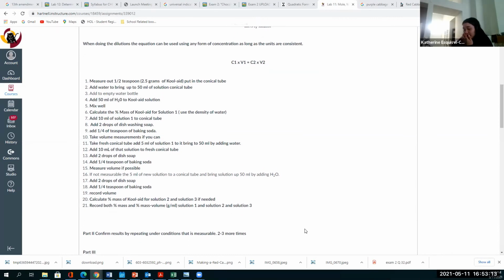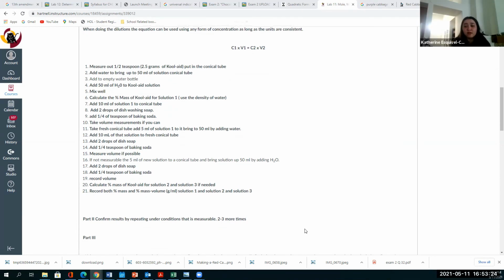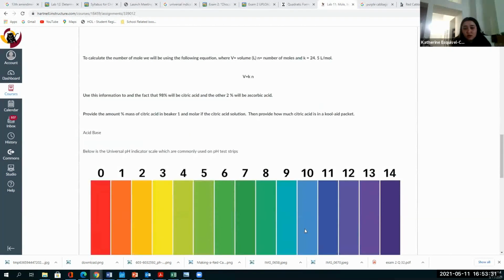A little bit. I'm a little bit lost. Don't worry. In class, we'll talk about those concepts. And then also in office hours, we'll be able to do that. Okay. So if I just stop here right now, I can finish, because I know I have to do the pH strips as well.